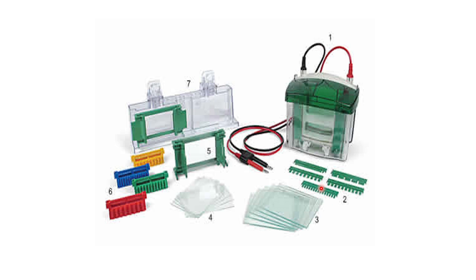But the way we should start is basically from number 7. Why is it so? We need 7, 5, so from 2 to 7, all of these are used in the preparation of an SDS-PAGE. This is the cassette where we prepare the gel, and this is the holder of the gel plates. This is a short plate, this is the wide, or thick, plate. We clamp both of these, tighten them using these clamps, and load it for the preparation of the gel.